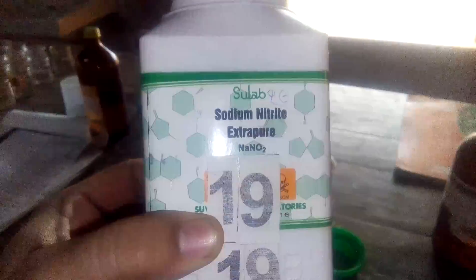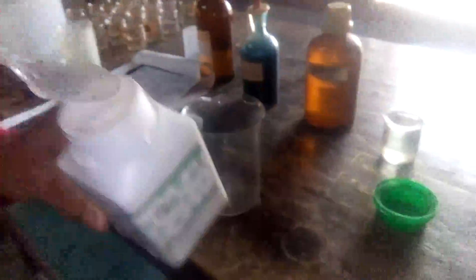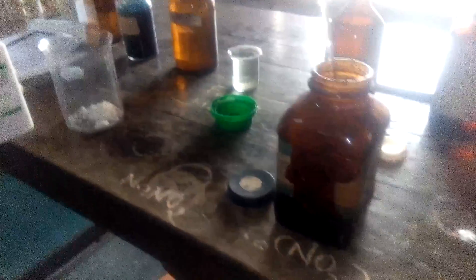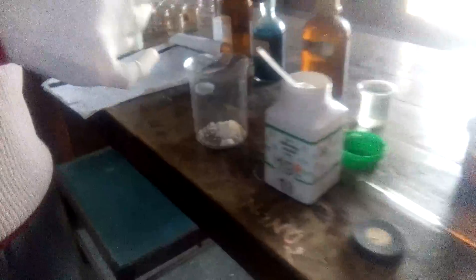First of all, take 10 grams of sodium nitrite (NaNO2) into the beaker. Now add twice that amount of cobalt nitrate into the same beaker.